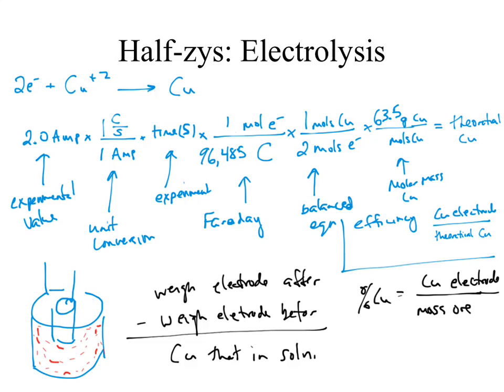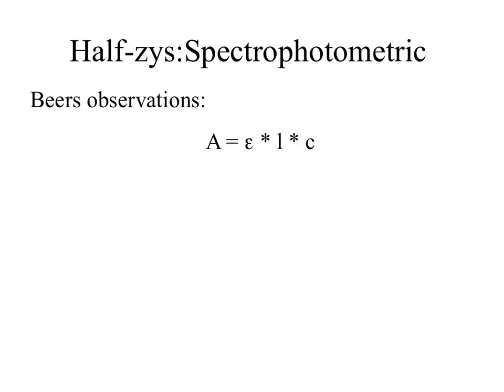Okay, this experiment is relatively boring. If 6 of you are in there, you can get one person to kind of watch all of the experiments while the rest of you go off and work on other things, and then alternate so that one person doesn't get shafted. Or you can just shaft them, that's fine too. Okay. This is only part of the experiment. So everybody that's getting ready to leave to the lab, what happens while you're waiting for this to occur? You could just sit around and wait, but then you definitely will not get done on time, and you will lose stuff. So what you can do is move to the next part of the experiment, our spectrophotometric part.